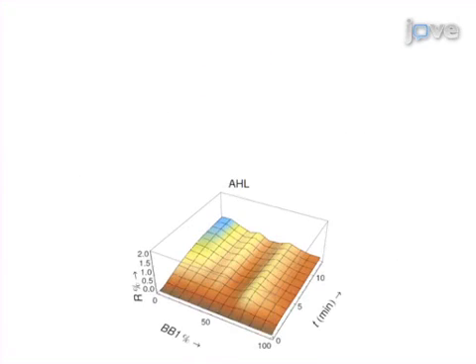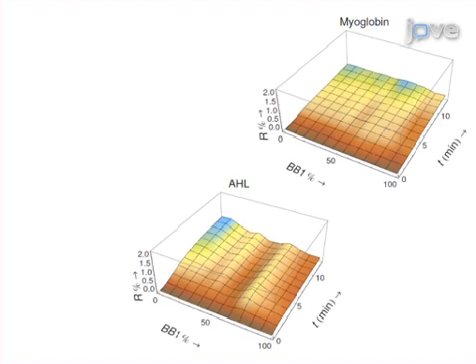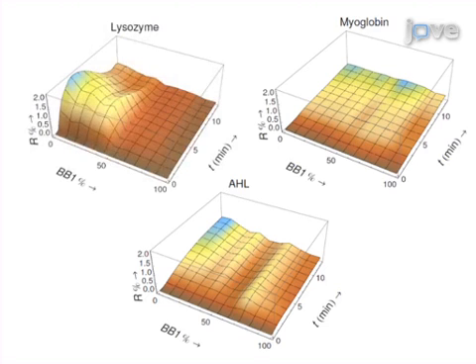The results show the electronic tongue is able to generate distinct 3D continuous evolution landscapes for common purified proteins and is efficient for their discrimination based on pattern recognition.